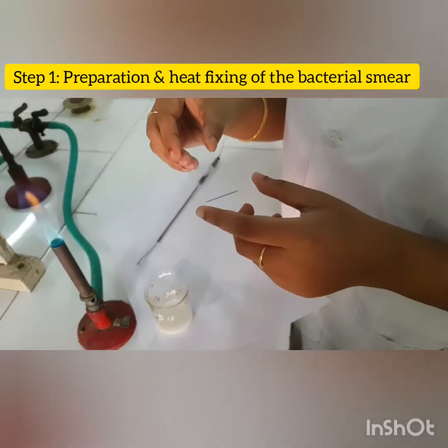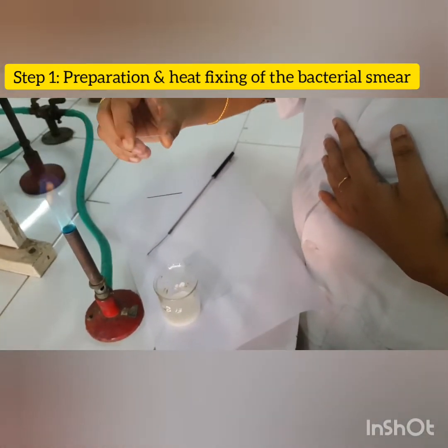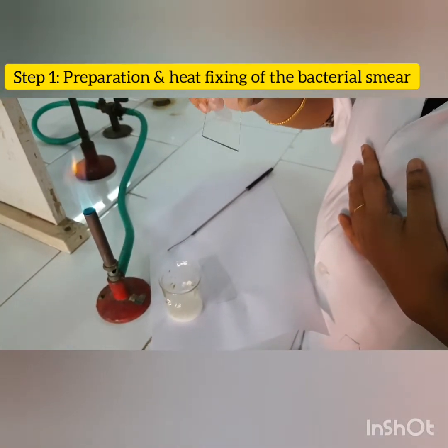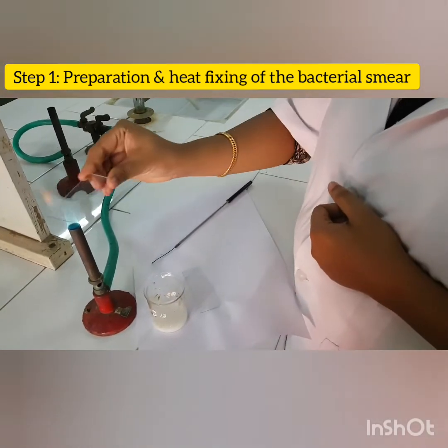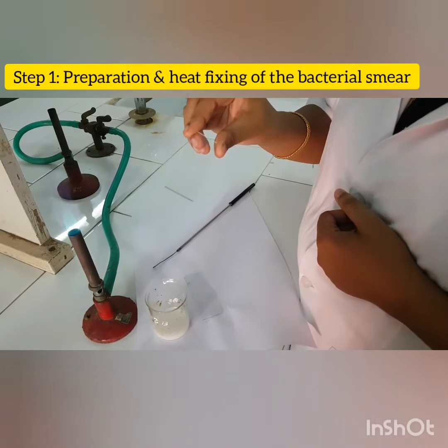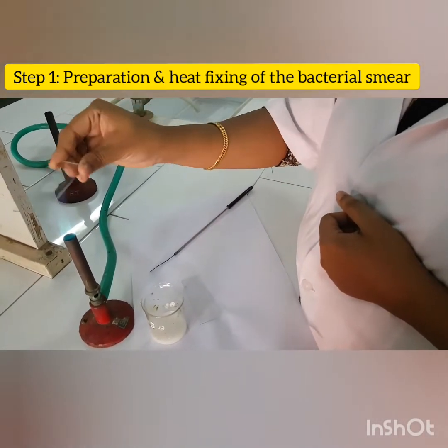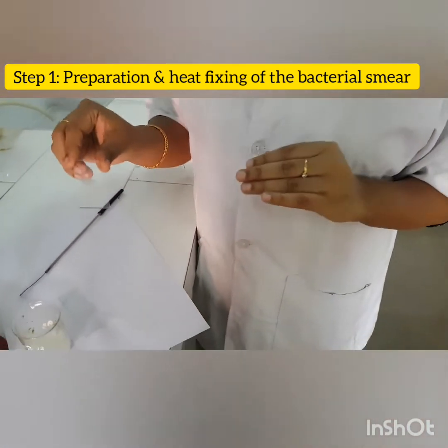Now, after the preparation of the smear, you have to heat fix it by passing your slide over the flame. Now we have heat fixed the bacterial smear.